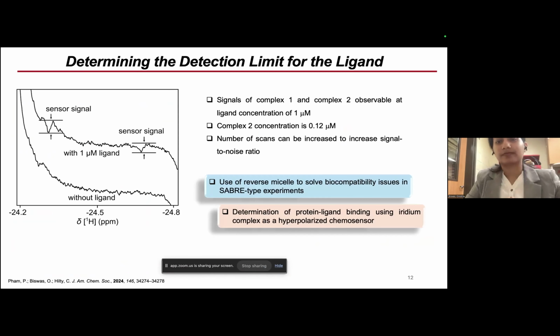Yes, 120 nanomolar. Ultimately, what is setting that sensitivity? Of course there's the system noise floor, but is it essentially the enhancement that's attainable, or is it something more fundamental, like binding efficiency? Do you think that's basically the limit of where you're going to get with this approach?